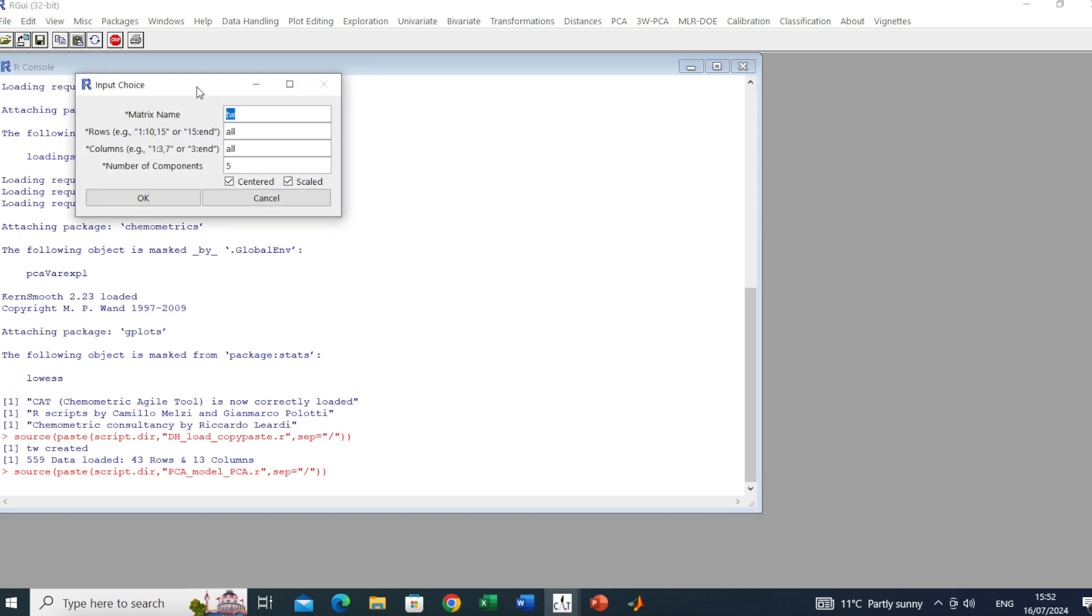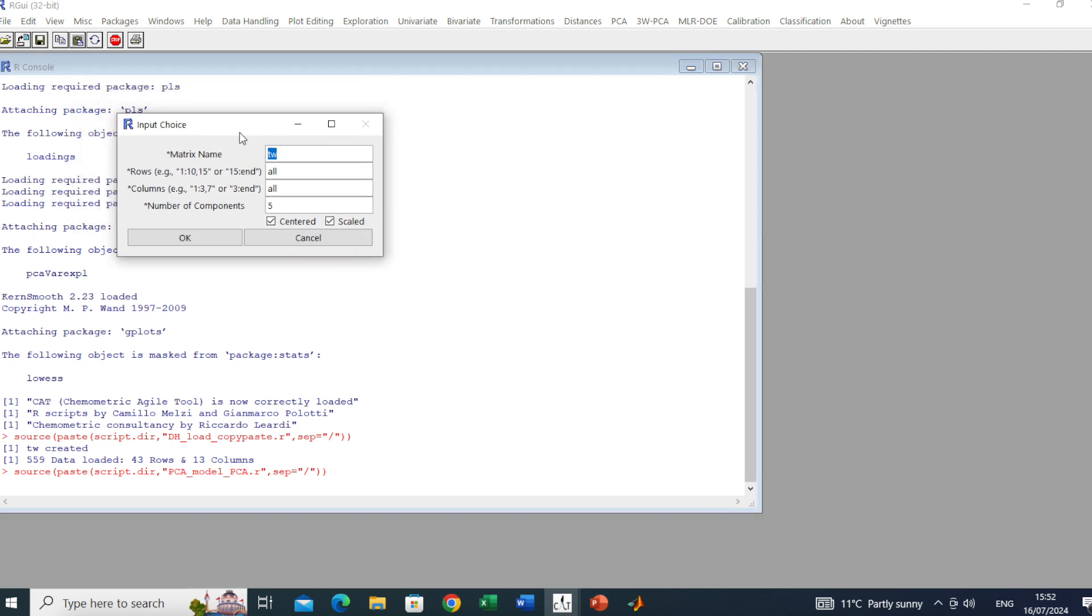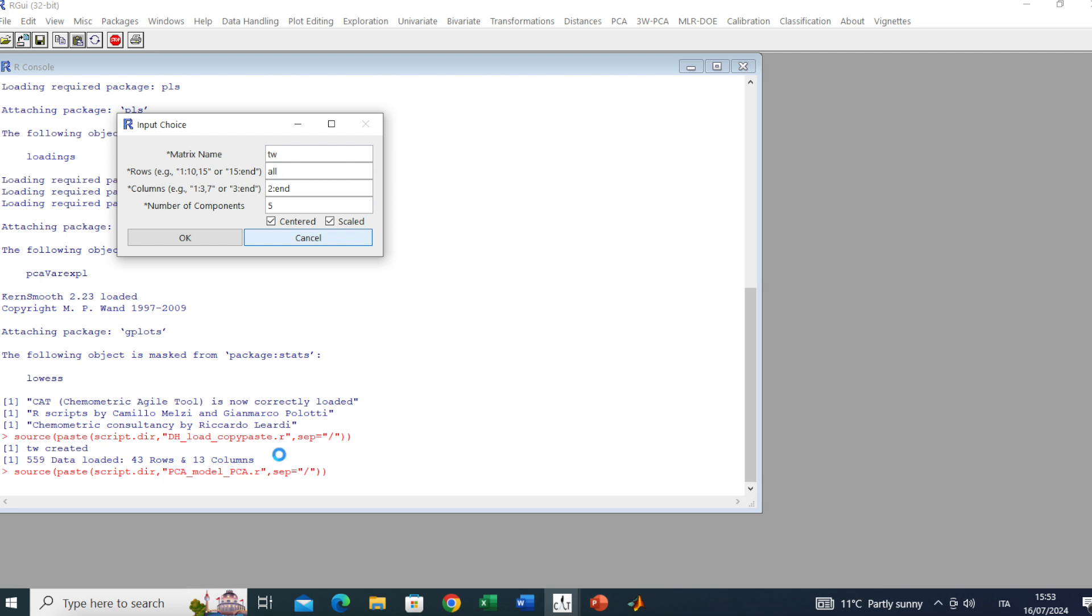Here we have the dialog box. We need to fill all the fields. Matrix name: TW, which stands for two whiskies. By default we have all rows and all columns. In this case we just want to consider the numerical variables, so we type in 2 colon and we can use end or 13, meaning until the last column.